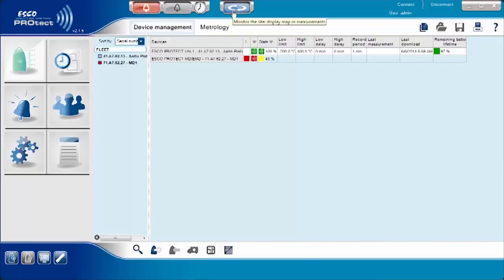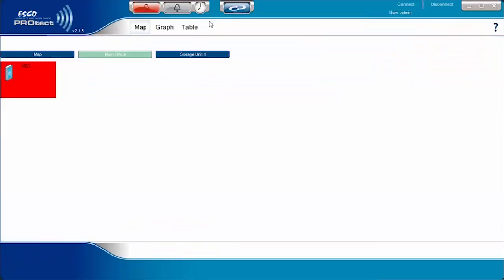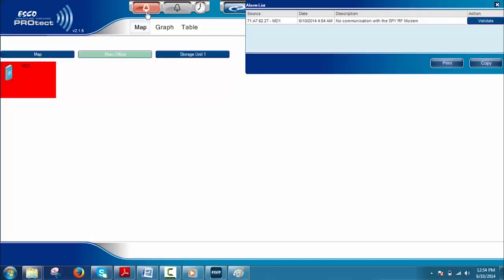When an alarm occurs, the alarm light located on the top of the ProTech window becomes red. On the plan, the concerned monitored unit becomes red and blinks. To acknowledge the alarm, click on the Validate button.